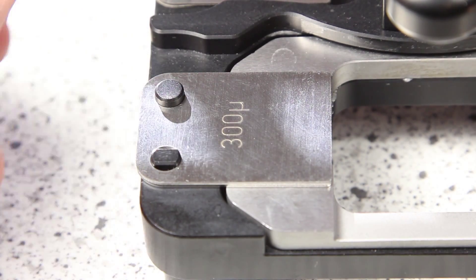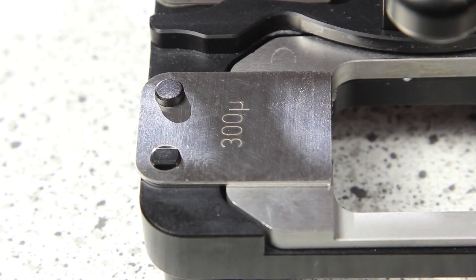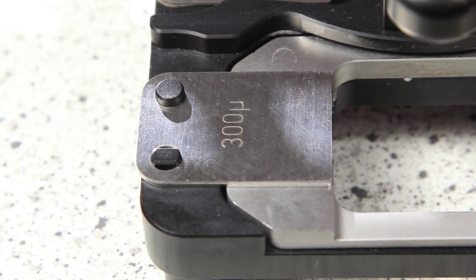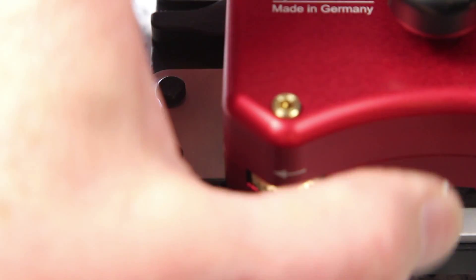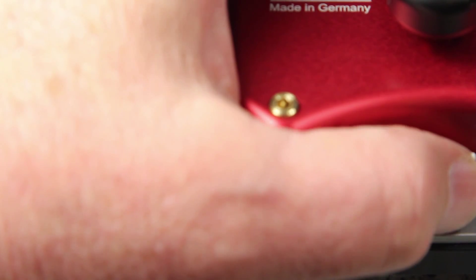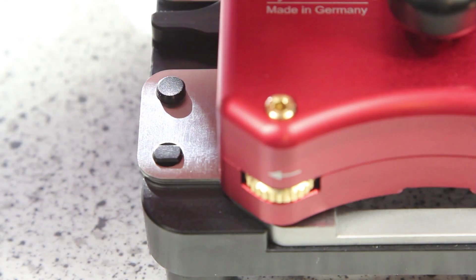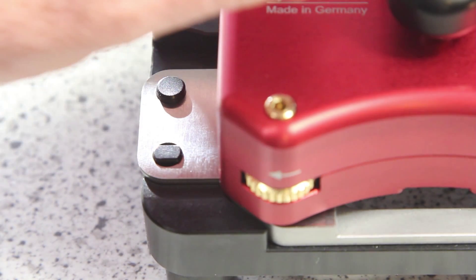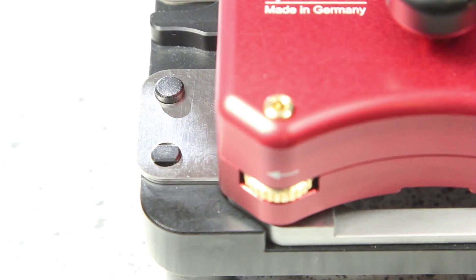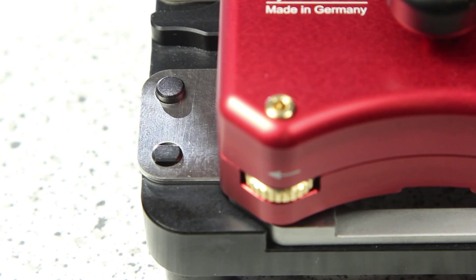I again turn back the feet completely and I put it into the setting device. I close and now I adjust to 300 microns.